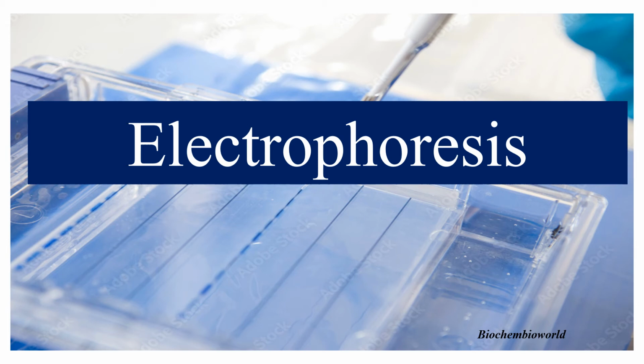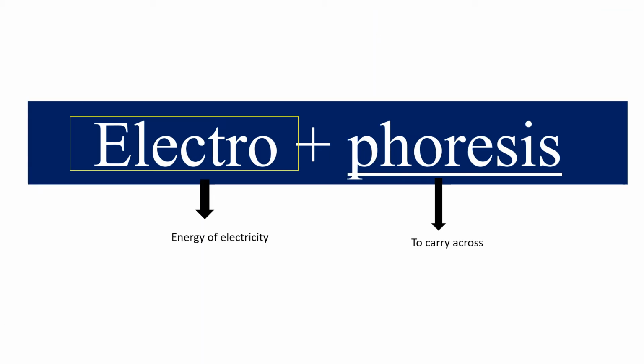Today's topic is electrophoresis. Firstly, I'd like to dissect this word, electrophoresis. It is made up of two words, electro and phoresis, where electro stands for the energy of electricity. That is the use of this electricity, and phoresis is a Greek verb which means to carry across.